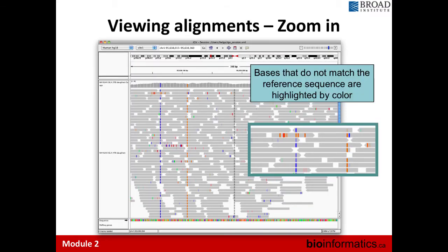Once data is loaded, each read is displayed mapped to the reference. You can see the reference sequence below in a color-coded bar — each color corresponds to a reference base: A, T, C, and G. The reads themselves also have little notches of color corresponding to SNVs between the read and the reference. Colors are based on the SNV itself — A, T, C, and G each have different colors. Base quality — how certain it is about that base — is displayed by the depth of the color shade. Lower base quality means a lighter shade, because you have less confidence. IGV is preemptively filtering out low-quality SNVs to help your visual cortex pick up high-quality ones.